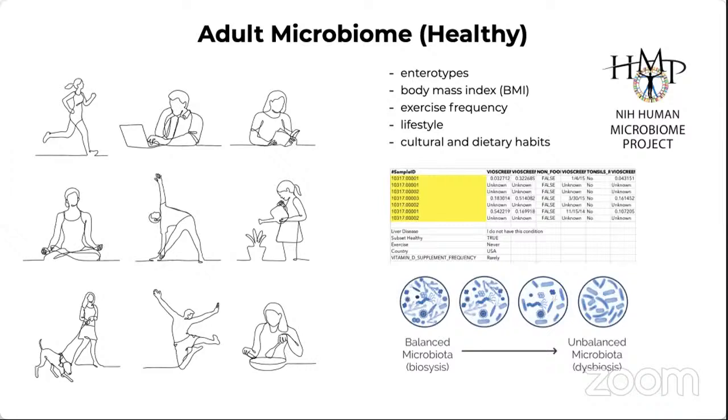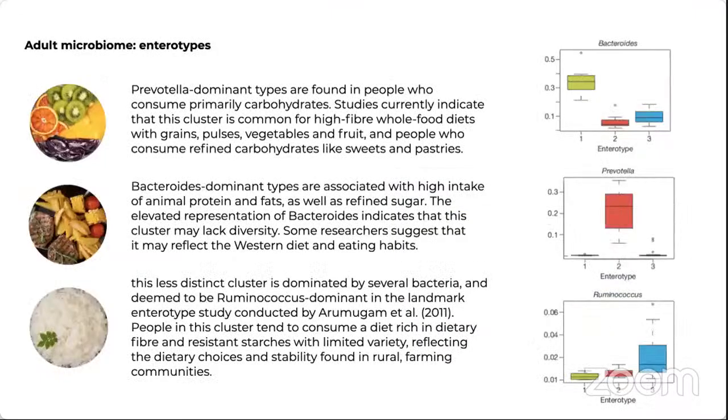We can actually identify a balanced microbiota, which is referred to as eubiosis or symbiosis, and we can also characterize the level of unbalanced microbiota, which is referred to as dysbiosis, in the event of microbial populations found in patients or people with chronic diseases, or people related to disease conditions in general. Right. In addition to this, we can also have several types of microbiome that are characterized for their ability to help us maintain a good eubiosis or symbiosis. These can be used in designing new probiotic samples, etc.